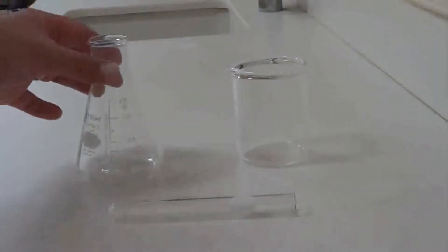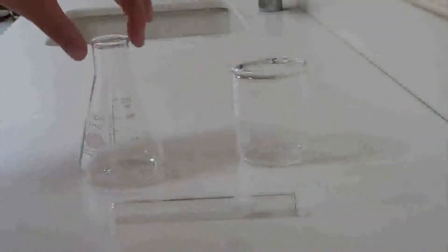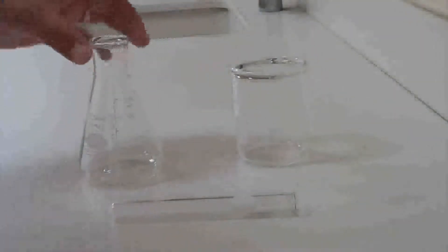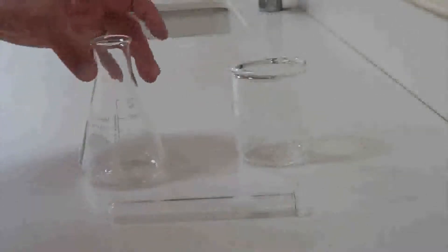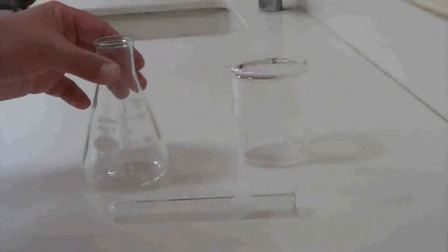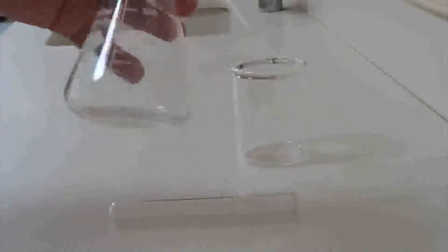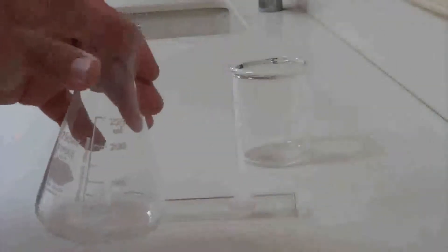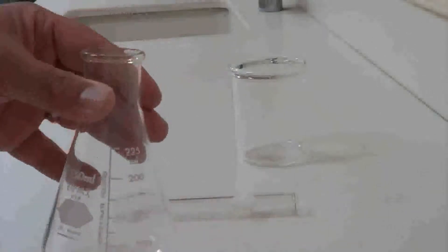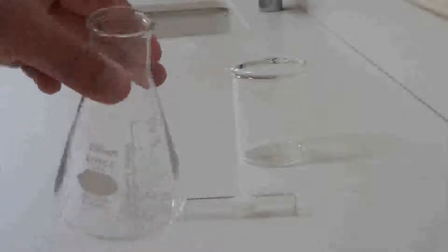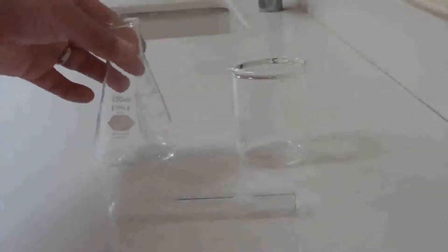Let's start with this one called an Erlenmeyer flask. You can see it has this very distinctive shape where it starts off almost like a cylinder and spreads out along the bottom. This is used any time you need to mix or stir a liquid. Notice how it's very easy to grab the top and swirl it. With the very small top, it's not going to spill out as easily. So this is primarily used for mixing things.